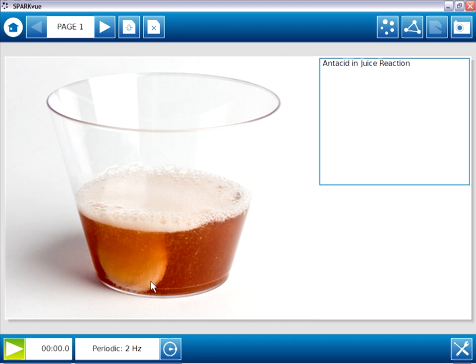What I'd like to do is look more closely at the page elements. You'll discover shortly that when we construct a SparkLab page, we're basically taking certain page elements and putting them on the page, much like building blocks. So I'd like to walk through and identify each of the page elements on the four pages.